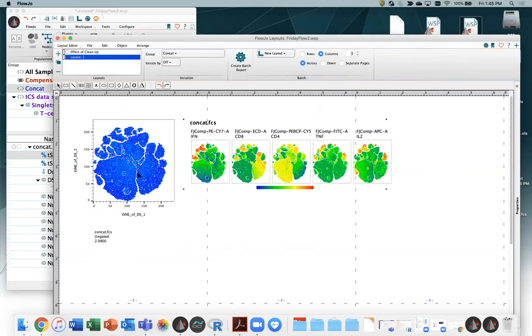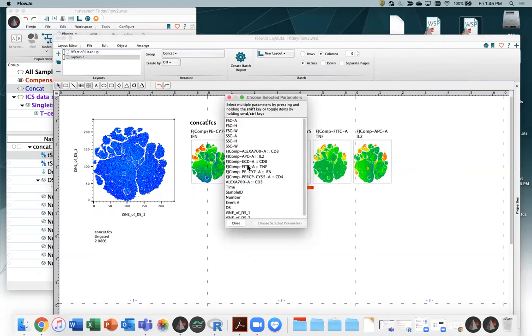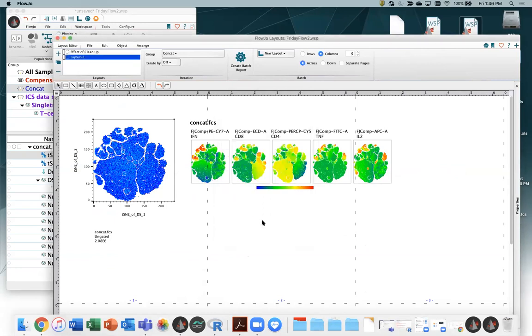Oh, and I could have probably also shown CD8 in that. Oh, and it was there. Whoops. I was thinking I selected it. Okay, it was IL2, I forgot. Okay. Anyway, so 4s, 8s, pretty much everything for 3. TNF across the top, interferon gamma over here. IL2 spread throughout, bunch of double negatives, and a lot of double negatives in this particular data set, since there is a fairly large bit of unstimulated files and then minimally stimulated.